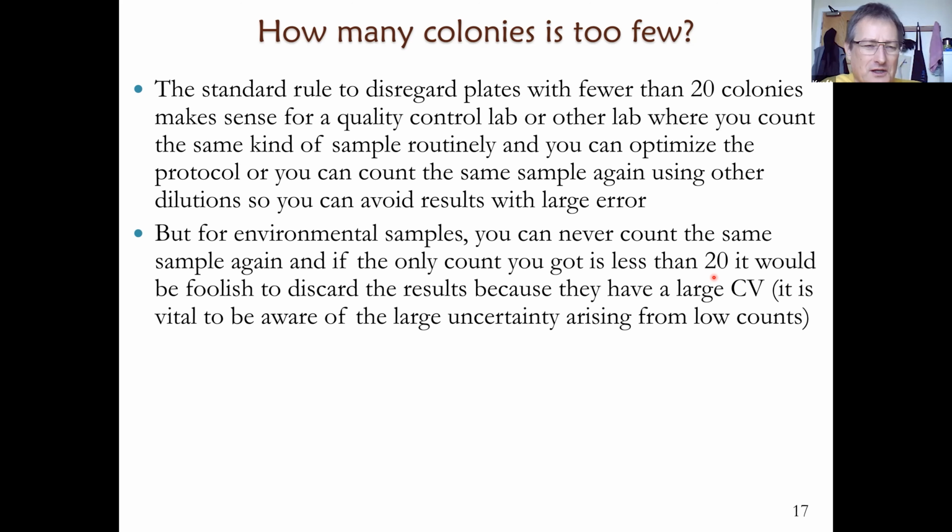So another thing that I guess should be discussed here is that we have talked about the sampling error so far, but this is not the only error. So we have the sampling error, which is unavoidable. There's nothing you can do about it.